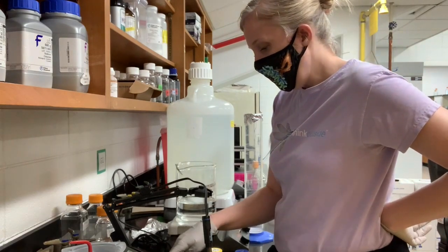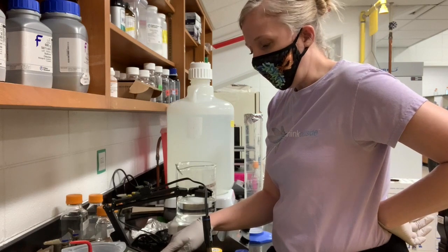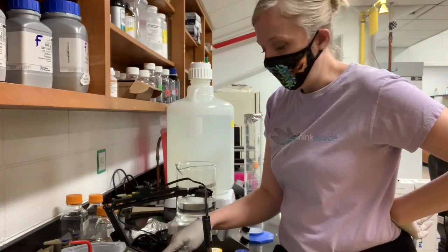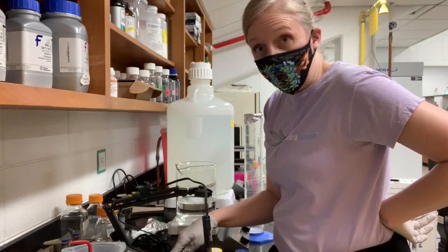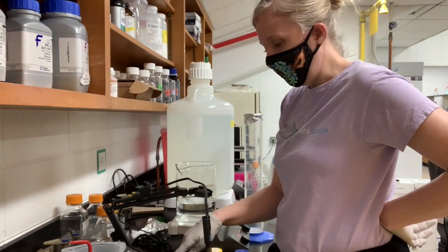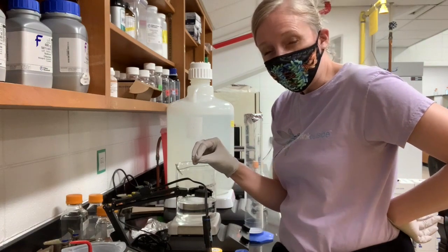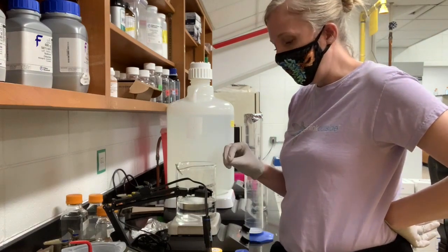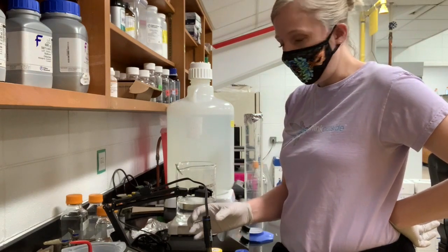I'm going to go to the machine, and if I press F1, there's a little black bar above that that will say cal for calibration. So I'm going to hit F1 and hit start, which is F3. And you'll see that the pH level will start blinking as the machine measures the pH of the solution that the meter is in.